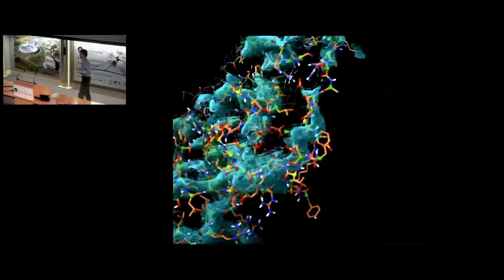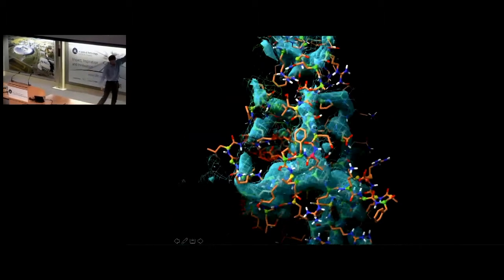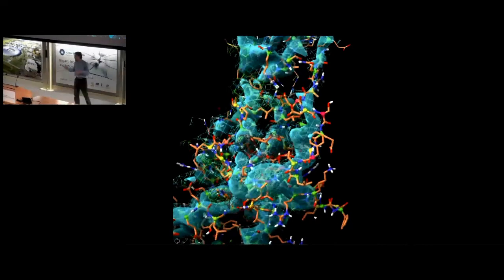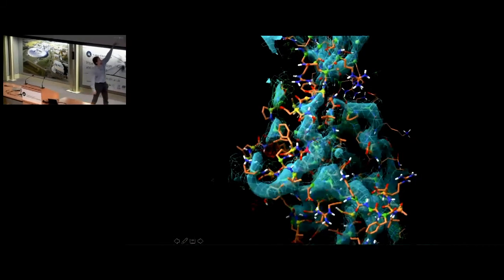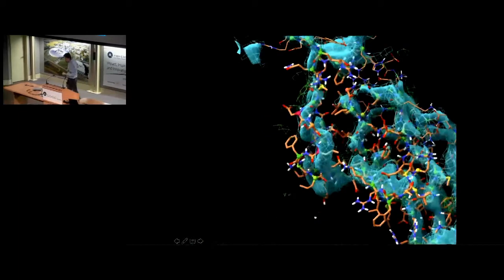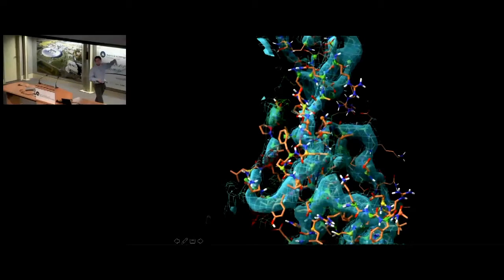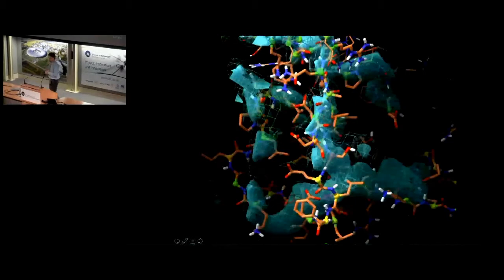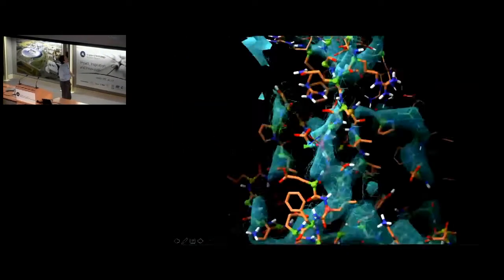Because of all these restraints, you can get essentially as aggressive with this as you like. If you've got this big region, you basically just pull things out here to get them back roughly to where they need to go. Start refolding these things into place. You can see probably that this actually really needs to be a helix. I will be adding the tool so that you can select a region of this and just simply tell it to become a helix, and it will go there. That was actually present in my previous version. It's just something I haven't quite gotten around to adding to this version yet.